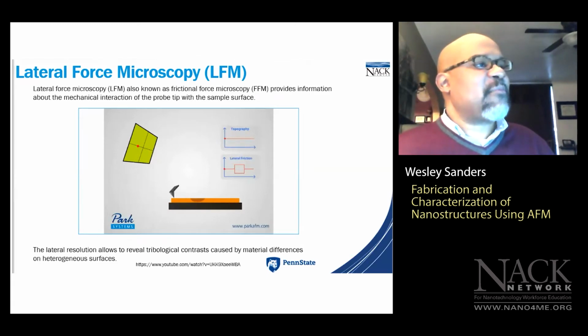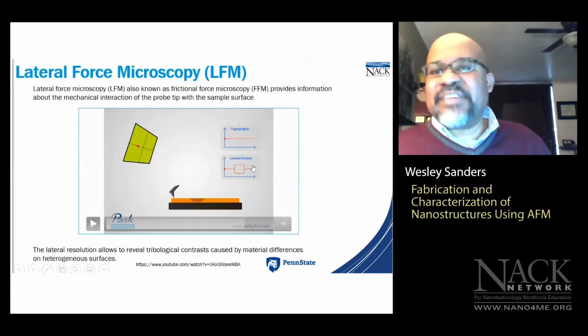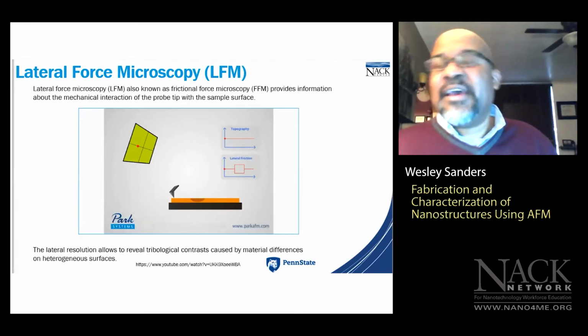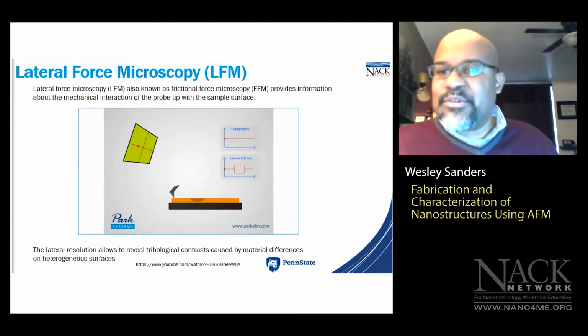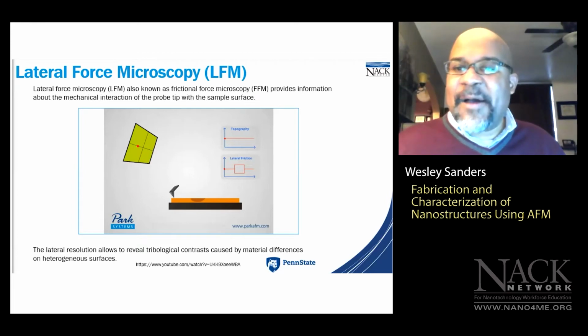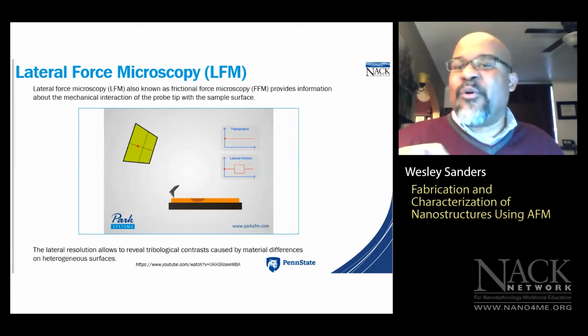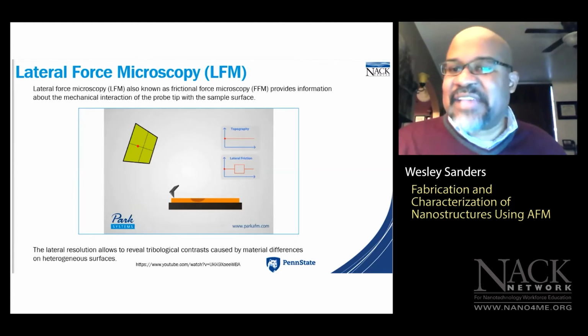Okay, and I want to stop it right there so we can focus on these two plots. Now, these plots are known as trace-retrace plots. What that means is, as an AFM user, as your tip or probe is scanning your sample surface, the AFM will record in real time line by line traces as the tip is scanning your surface.